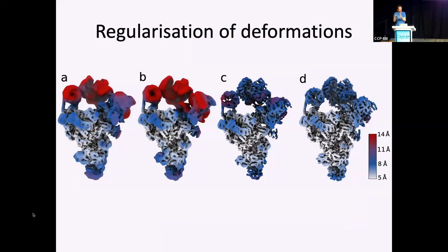So you need to tell Gaussians, you have to walk together if you're close to each other. If you do that using an atomic model and you more or less impose the structure of the atomic model with some restraints, then you get very nice high resolution improved reconstructions in DynaMight. If you take a slightly less agnostic approach where you don't use an atomic model, you just build a map randomly with Gaussians and then keep neighboring Gaussians close together, moving in the same direction, then you get this solution. So you might say, okay, put in your atomic model, go for it, and you get this map. But, of course, then we have to be careful.